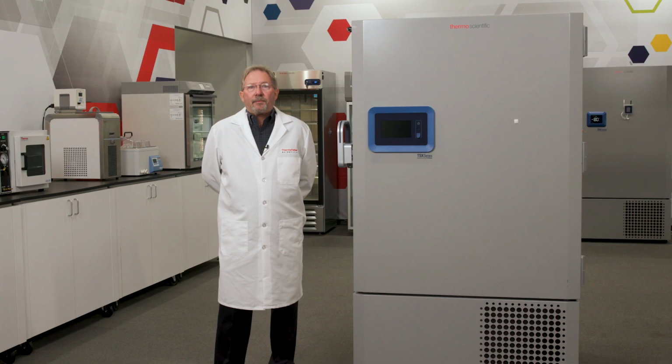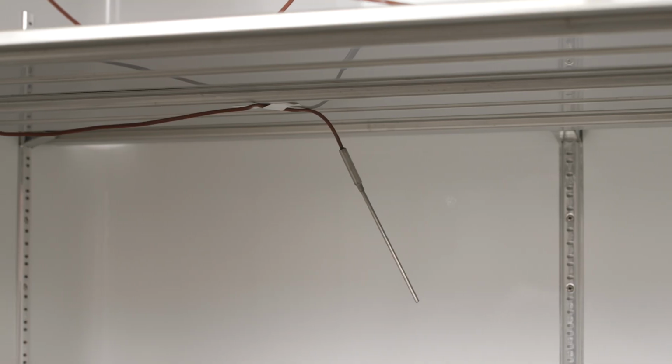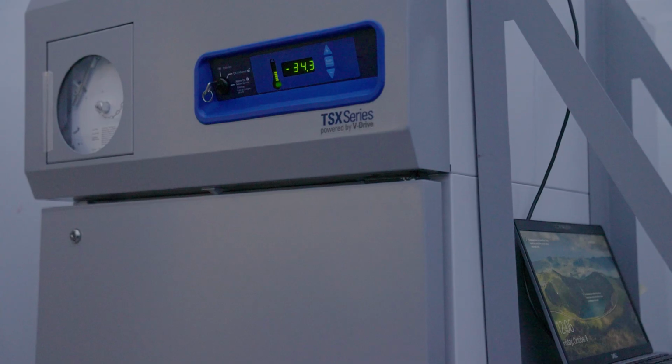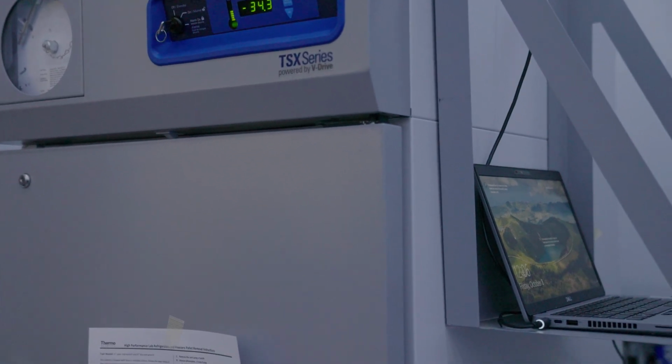I'd like to thank you for joining me in this short discussion regarding temperature uniformity testing, or what most refer to as temperature mapping. In the past few months, I've received multiple questions focused on how to successfully map a controlled temperature instrument like a freezer.